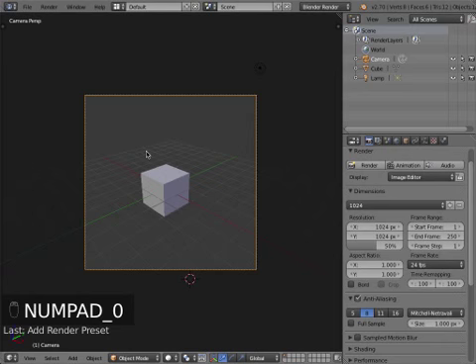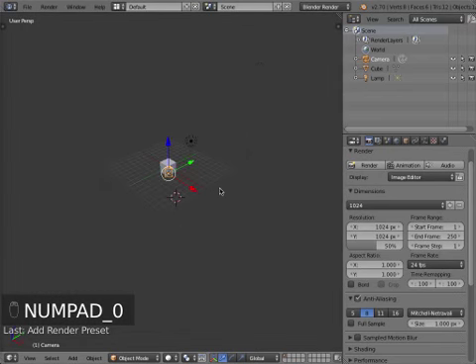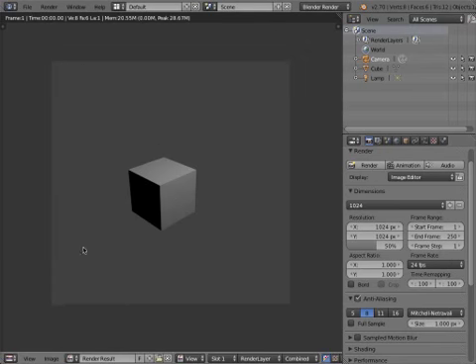And you can see the camera outline has changed now. It's square. It was rectangular before. And it renders out at 50%. So if I click render now, this is actually 512 by 512. So that just has the purpose that you can do quick renders and check whatever you're doing, and then later come back and just crank it up to 100% and do your final render.